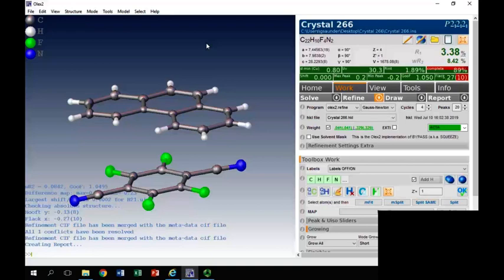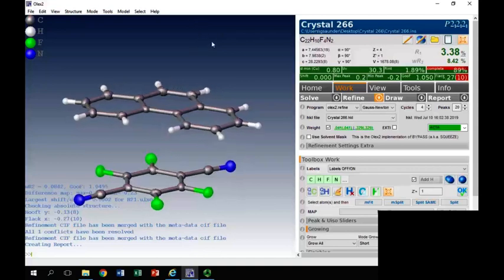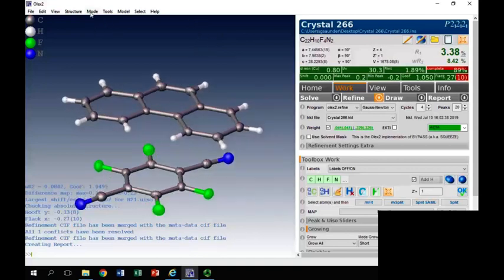When you talk about the C1, C2 bond distance, we need to know where C1 and C2 are, otherwise it's meaningless. So you need one figure where you label things, but maybe in the packing figures you don't need to. And I should talk about how you label your structure right at the end.